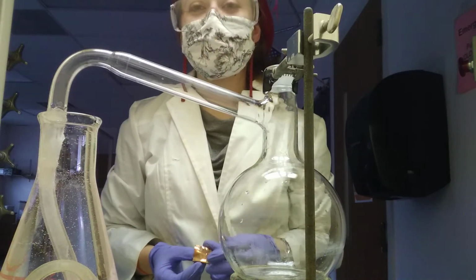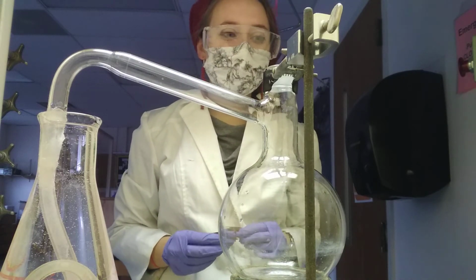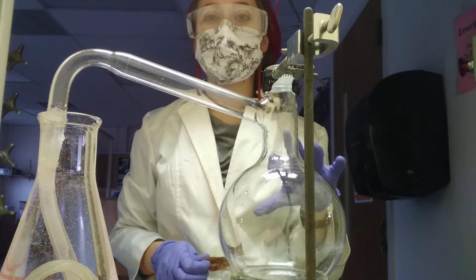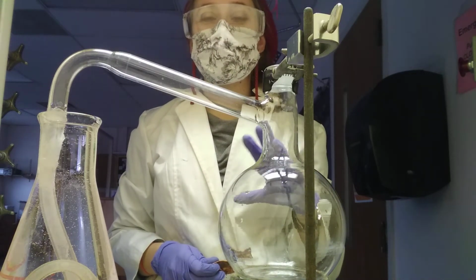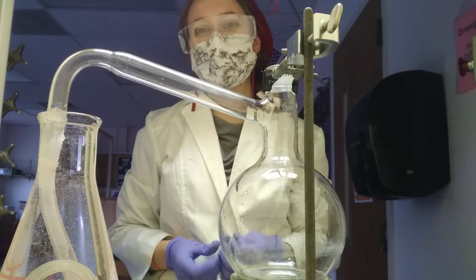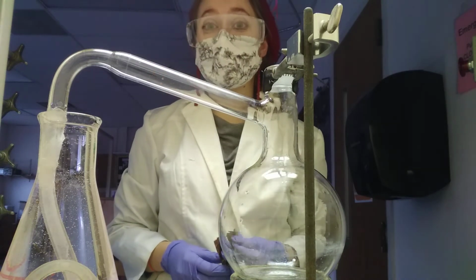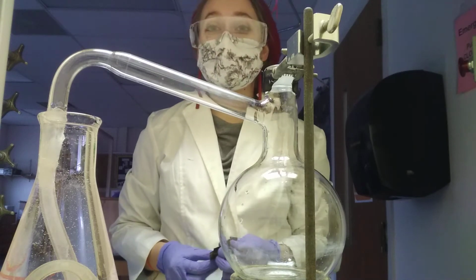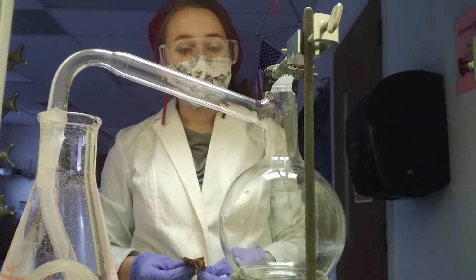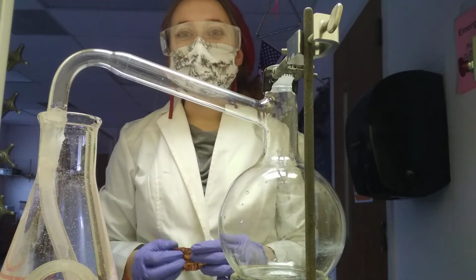There's a story that's popular amongst many chemistry teachers. It tells the story of Ira Remsen, who wrote a short story about his interpretation of the phrase "nitric acid acts on copper." What does that mean? Because we all know what copper is. I have a piece of it right here. And you might know what nitric acid is. It's an acid, and its formula comes from nitrate, so you might be able to figure out how it got that name since we've talked about that. But that term, "acts on", nitric acid acts on copper, is what we're going to look at today.